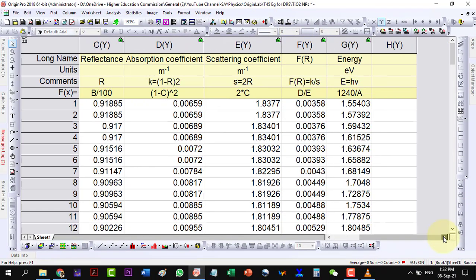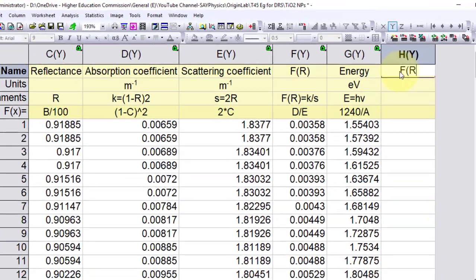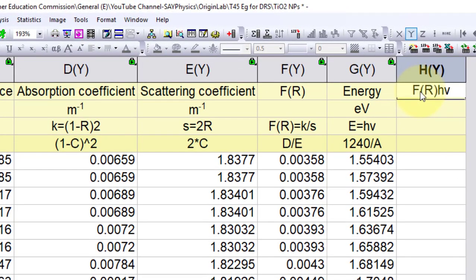We will calculate F times energy in units of electron volt centimeter inverse with power one-half by multiplying column F and G with power one-half.